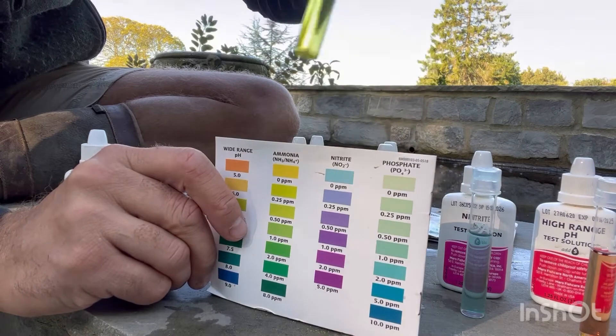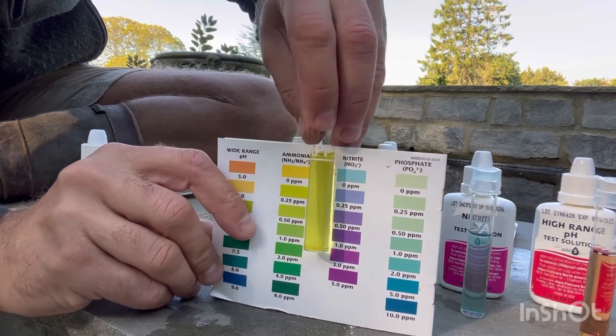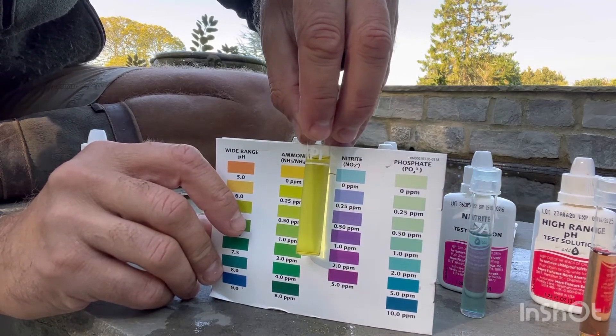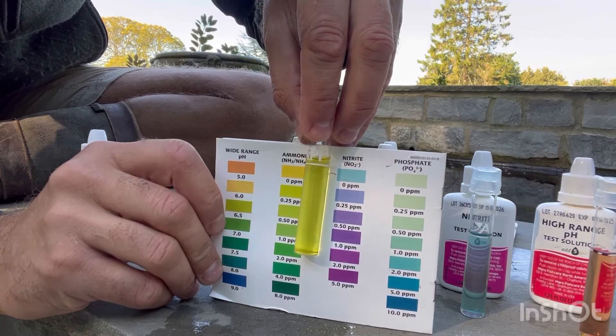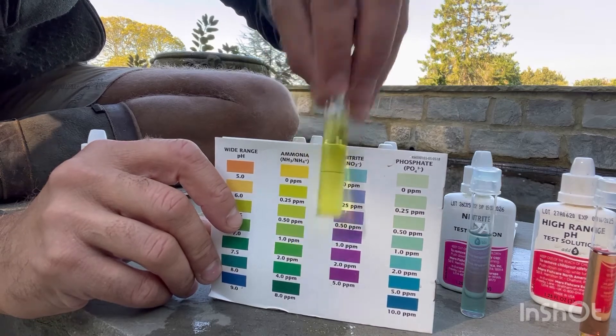Ammonia next. Sorry to say it, but a nice straw, sort of hydrated-urine color — there it is. What you're looking for is no green tints. If you start to get any elements of green, then you're going up in parts per million of ammonia. That tells me zero. Well happy with that.